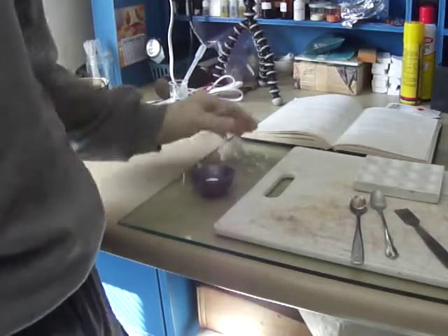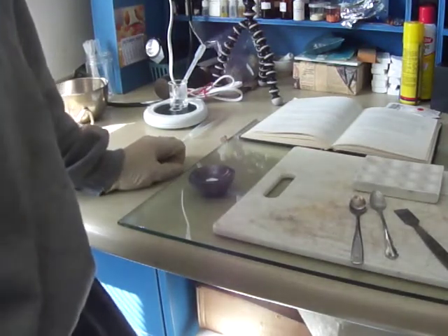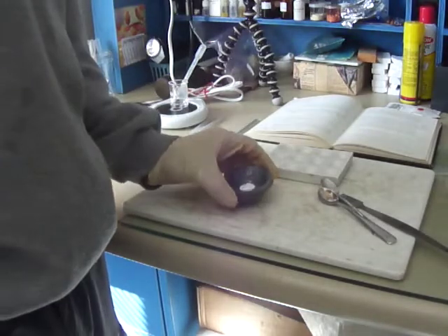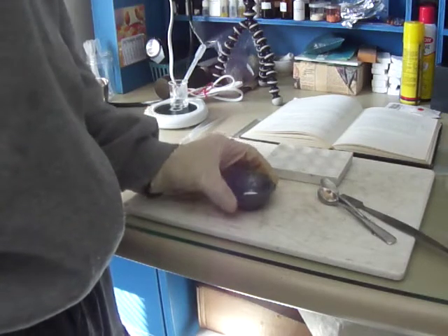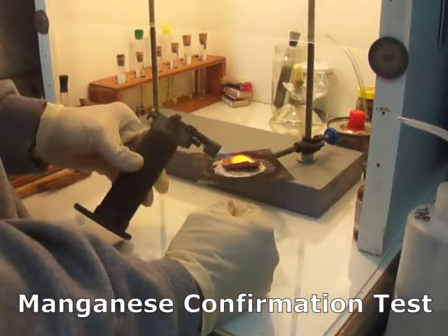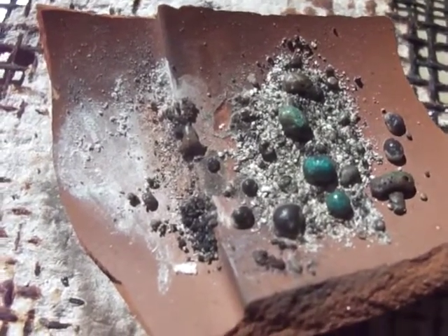Now the manganese confirmation test in this book uses sodium bismuthate, which I don't have, and it's difficult for me to get or make. So the other confirmation test that is quite common, in addition to the borax bead, which we already did, is an oxidation fusion with 4 parts soda, 1 part potassium nitrate, and the sample. So we're going to get that ground up. And you can really see the blue color on some of those beads that I just started to do the fusion on. So definitely manganese.